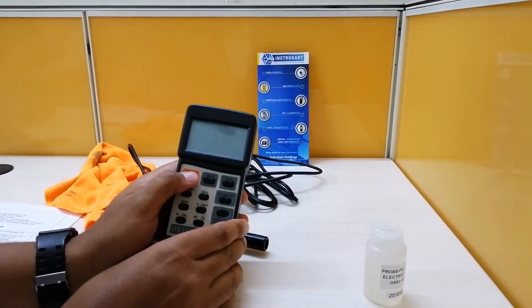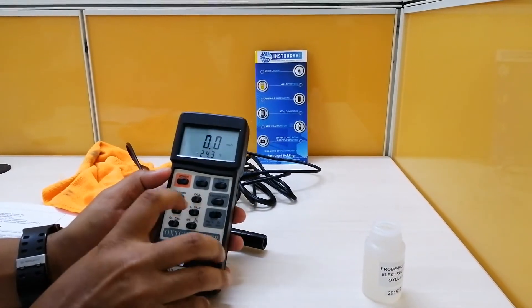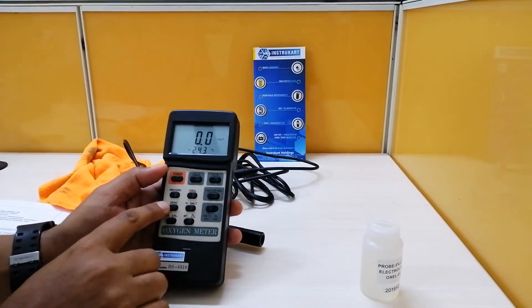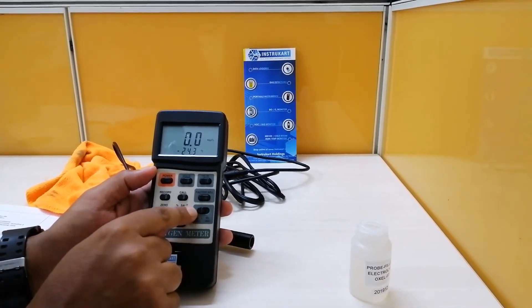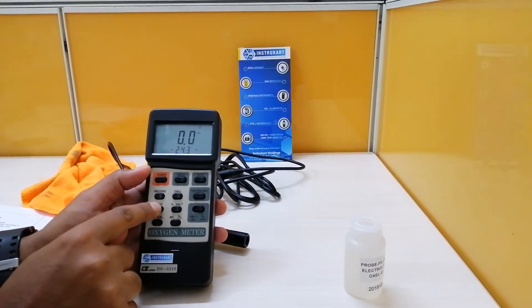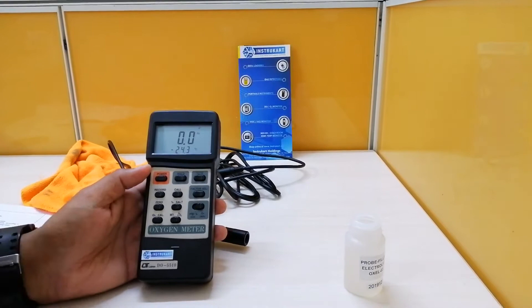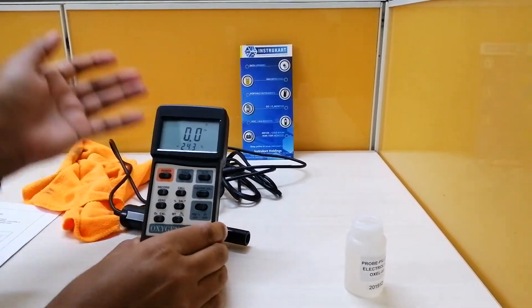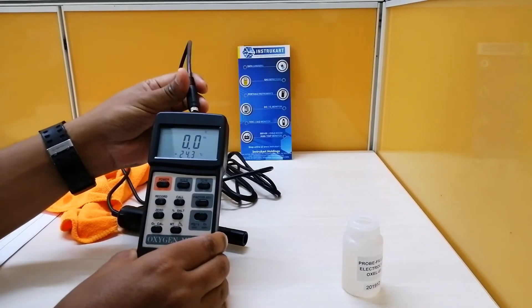A drop should be enough for this to work. I'll put the cap on. Then I have to power on the instrument, press this button to switch to oxygen mode, press the zero button, and then connect the probe.